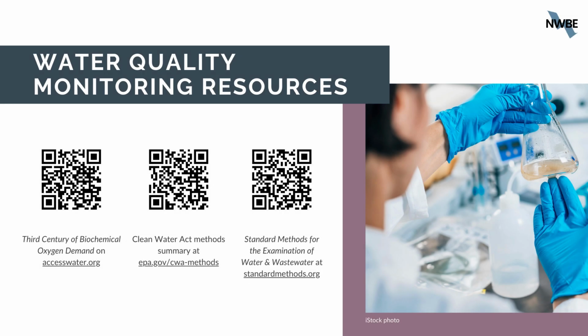And here are some relevant resources. If you want to do a deep dive into BOD, it's an assay that was developed starting back in the 1800s. I recommend you check out The Third Century of Biochemical Oxygen Demand. Interestingly, in that book, the authors note that, quote, many wastewater professionals have predicted the imminent demise of the test. They're talking about the BOD test.